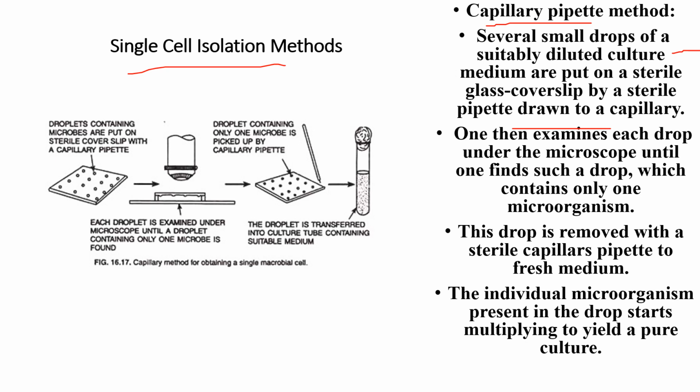One then examines each drop under the microscope until one finds a drop which contains only one type of microorganism cell.